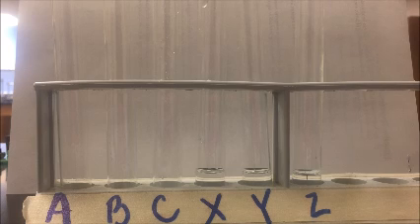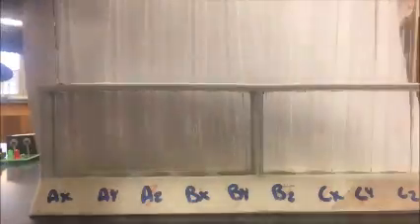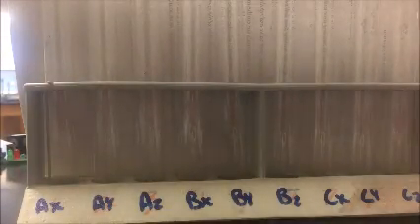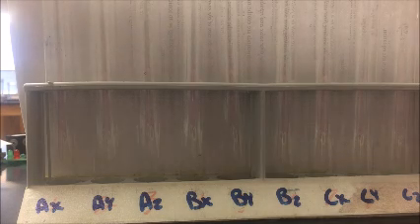So now what I'm going to do next is create the mixtures. I'm going to mix compound A with compounds X, Y, and Z. So first, I am going to put compound A, sorry guys, just trying to make sure you can see, with compound X.